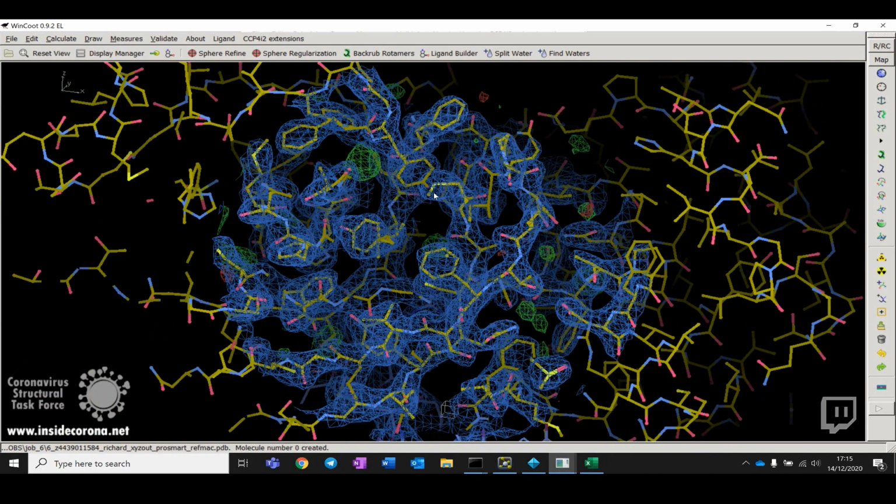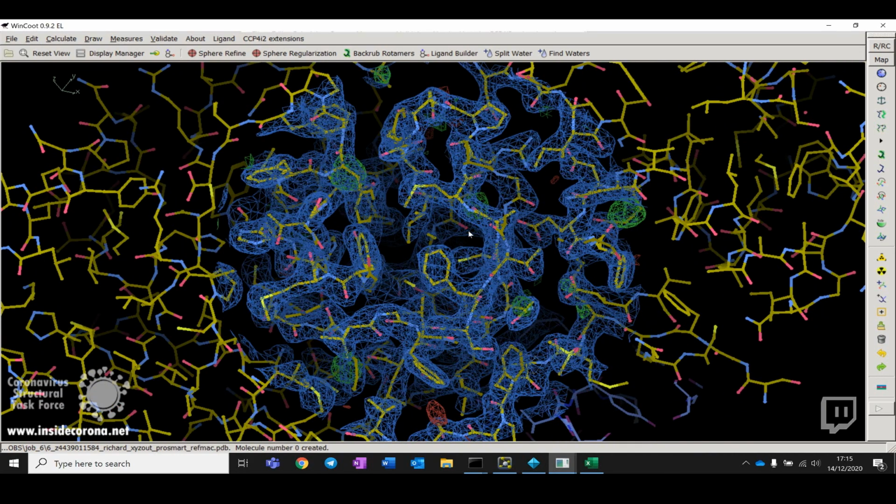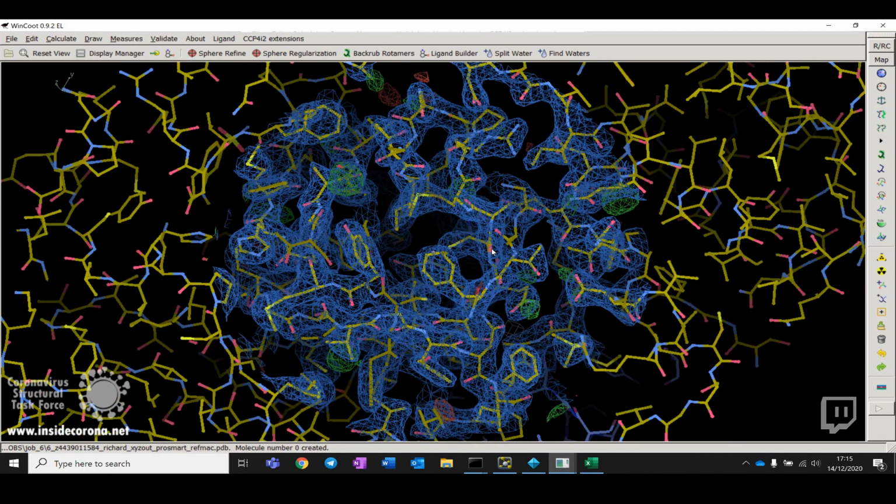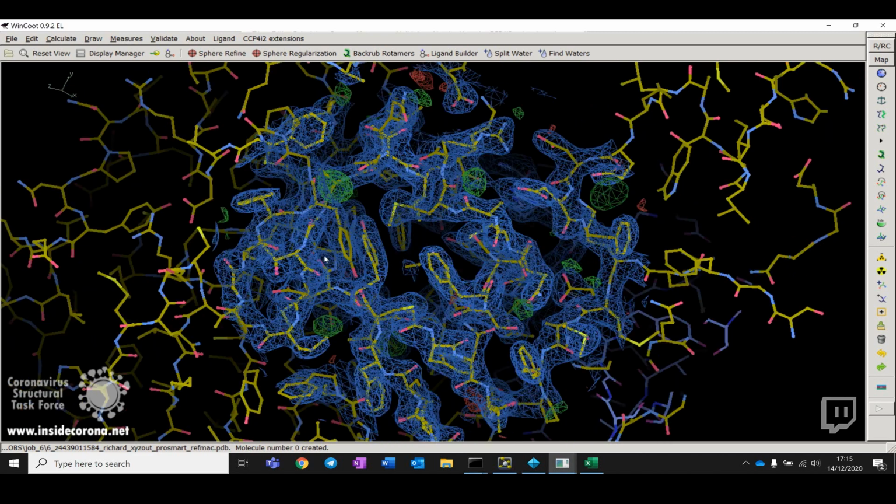I'm just going to give you a quick walkthrough of the sort of stuff we do with a structure, and why that might be interesting and helpful in the fight against COVID-19.